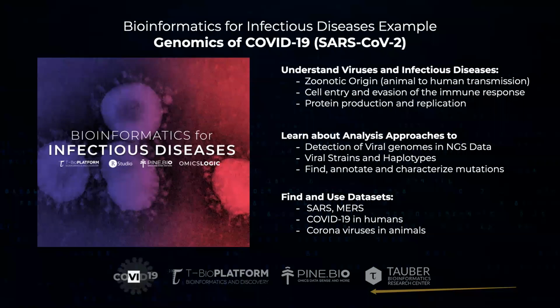So we'll actually go to a database where we will find some sequences from the SARS, MERS, and other coronaviruses that are available. And we'll talk about how to specifically find the COVID-19 samples. And then we'll also look at different hosts, animals, humans, different types of animals, etc.